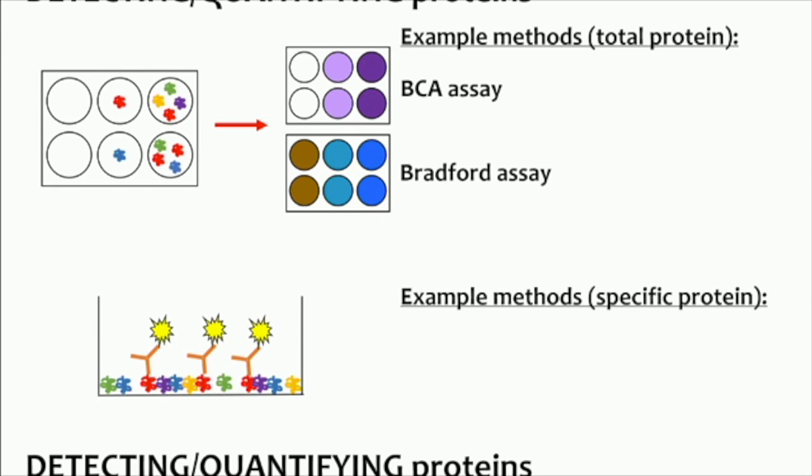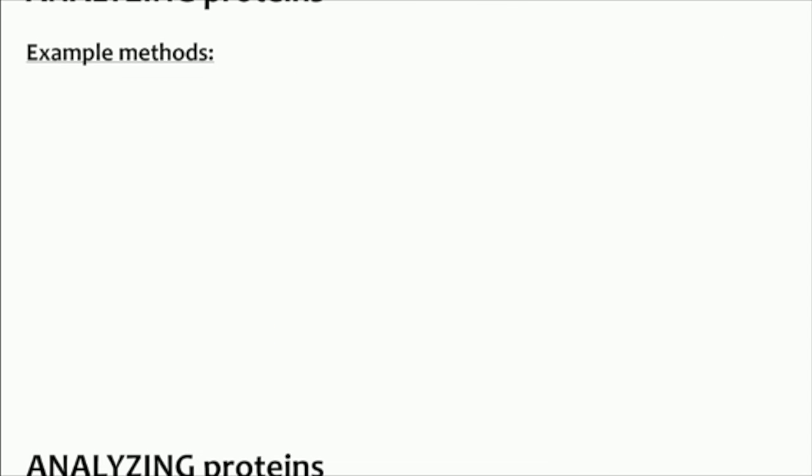There are different ways you can do this. One of them is an ELISA, one's a Western blot. ELISAs, I think, is what was described in the antibody lecture, but nobody's done a Western blot ever? Or kind of, maybe, sort of a little bit? Okay, well that's good. That's another method that can use antibodies, and that's going to come a little bit later.